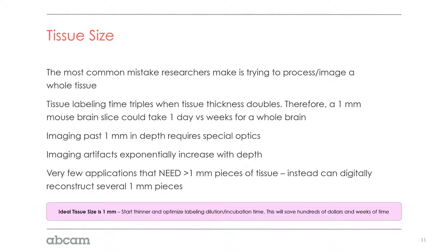What most researchers do is start way too large with the tissue. They spend weeks trying to optimize with antibody labels and hundreds if not thousands of dollars on labels trying to get them to label a large tissue. The problem is that tissue labeling time triples when tissue thickness doubles. Therefore, we suggest taking tissues such as a mouse brain hemisphere and slicing into one-millimeter thick pieces for imaging and processing.